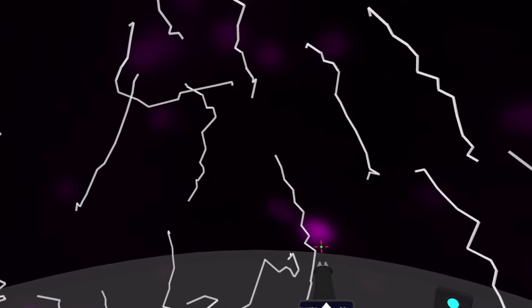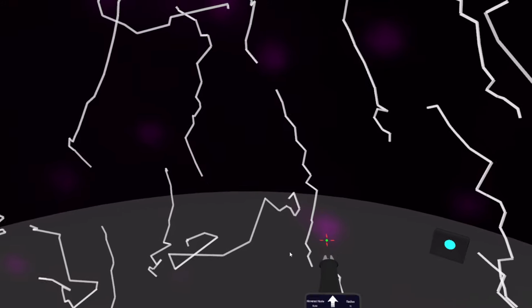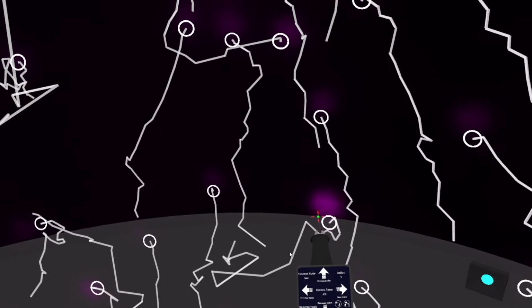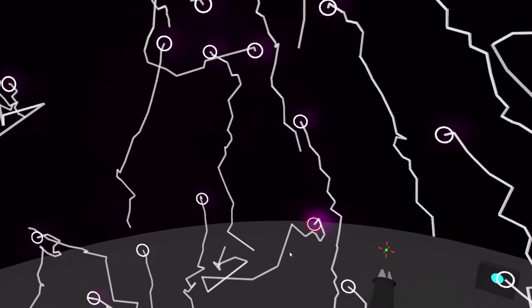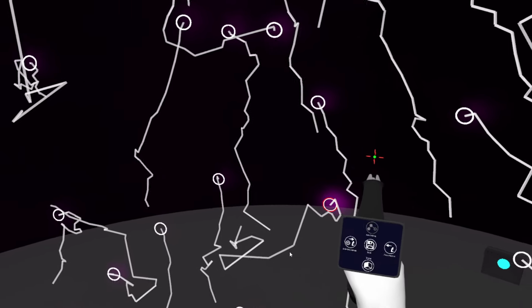And so I can continue, for example, and I can just keep tracking it all the way until I have reached my annotations that I had here. Boom. And then I just click the last one and this adds an auto link because I have the auto linking feature turned on and I can turn it on and off, right?